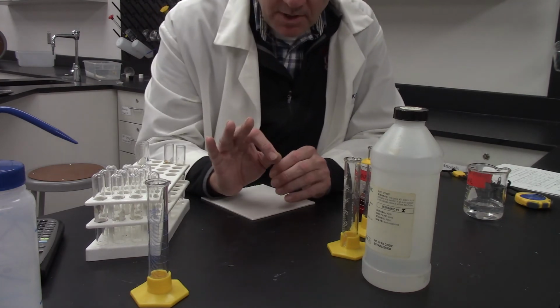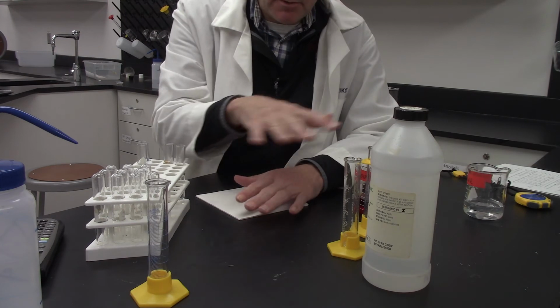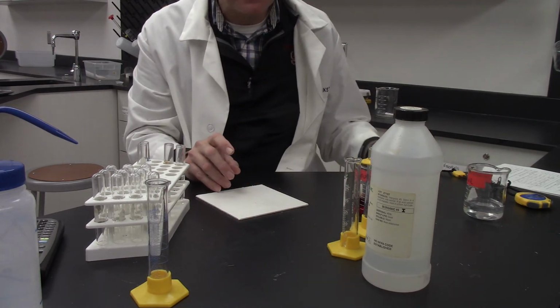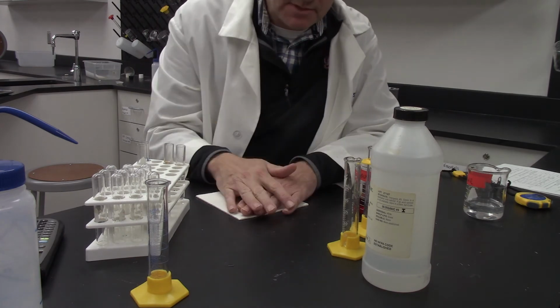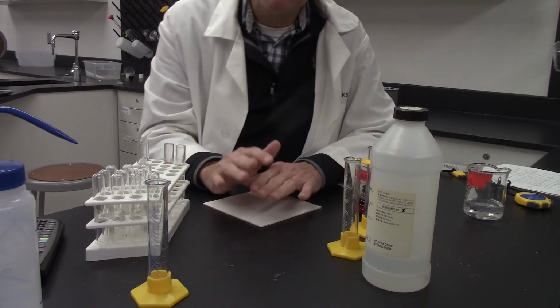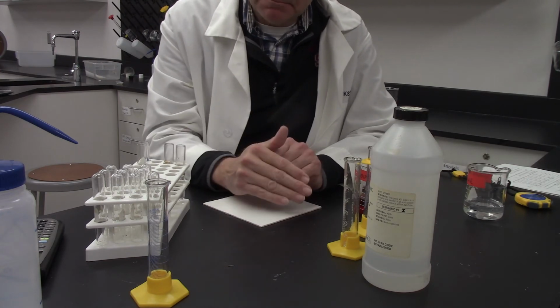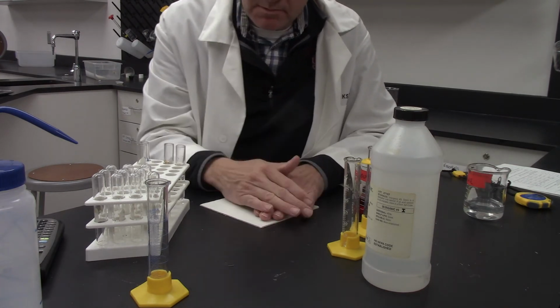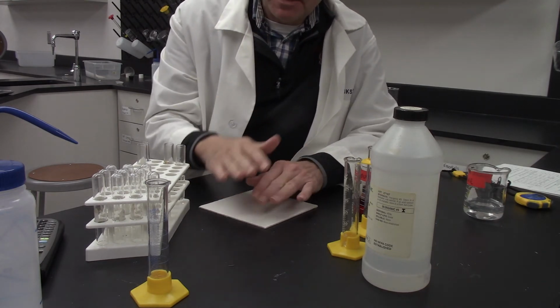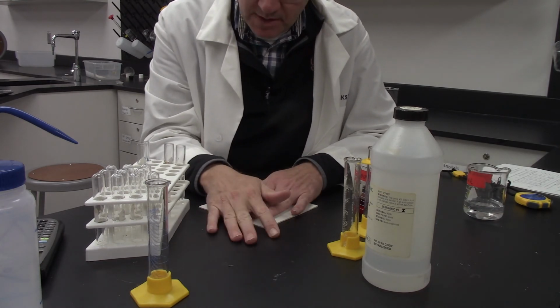The third part of the lab is that I'm going to run reaction number 2, which is what we just did. I'm going to run that at 3 different temperatures. I'm going to run it at room temperature, which is about 20 degrees. Then I'm going to heat it up and run it at a warmer temperature, and that reaction is going to take place really, really quickly. And then I'm going to put it in an ice bath, and I'm going to slow it way down.